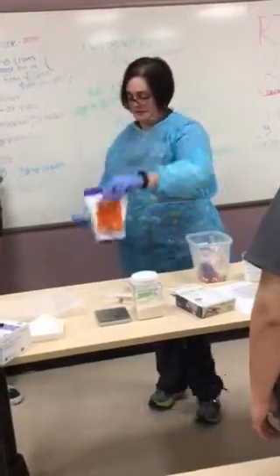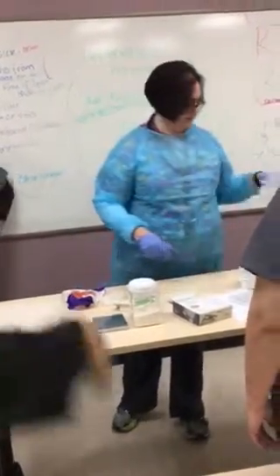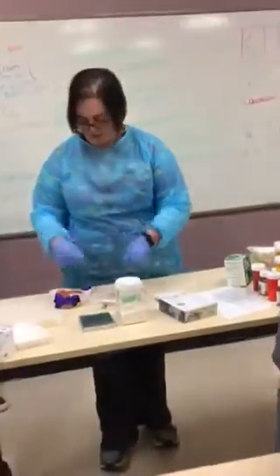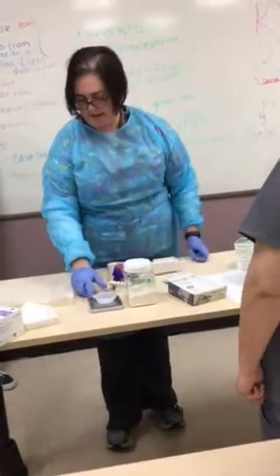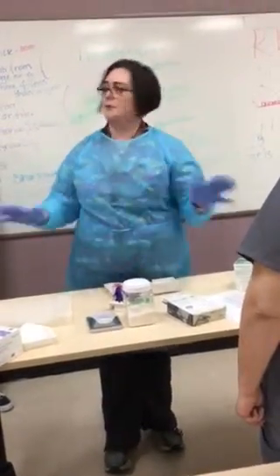So I'm going to use this because that's the one that fits in here. I'm going to go with 3 grams because I mentioned that. And I'm going to tear this out, which means I'm going to zero it out. And I'm going to be careful not to bump the table.